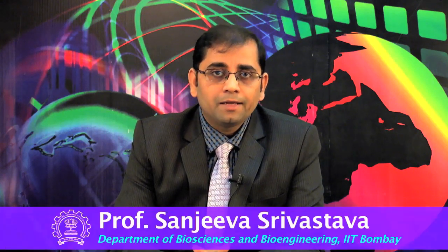In conclusion, we hope that this lecture and the series of 5 lectures so far has helped you to appreciate the importance of sample preparation for mass spectrometry based identification of peptides, the need for enrichment of post-translationally modified forms of peptide prior to MS analysis. The lecture has also provided you a glimpse of how impurities in the sample can lead to errors during the identification of peptides. And additionally, you were introduced to the concepts of PSMs and how a specific software like SpectrumMill uses PSM to score the hits. Lastly, you were explained the concepts of phosphosite localization and scoring using suitable examples.